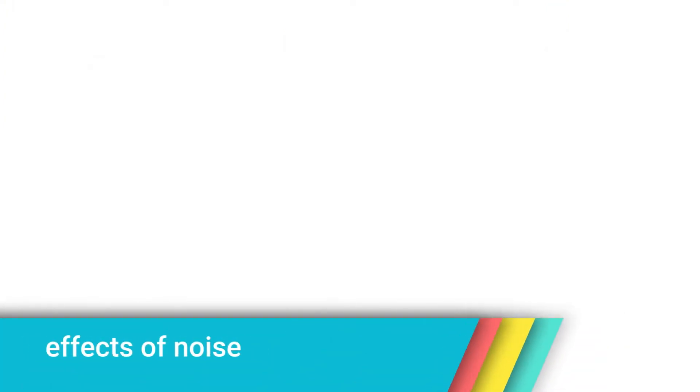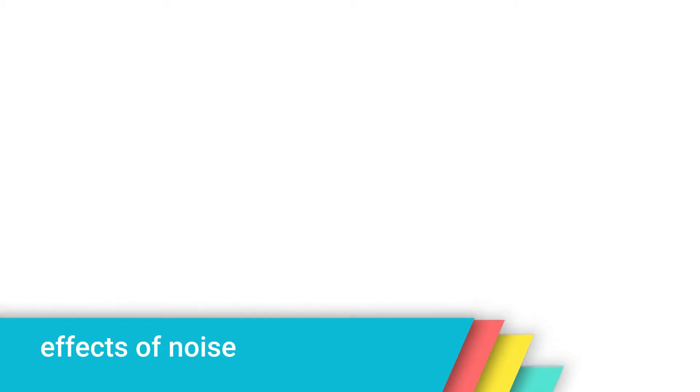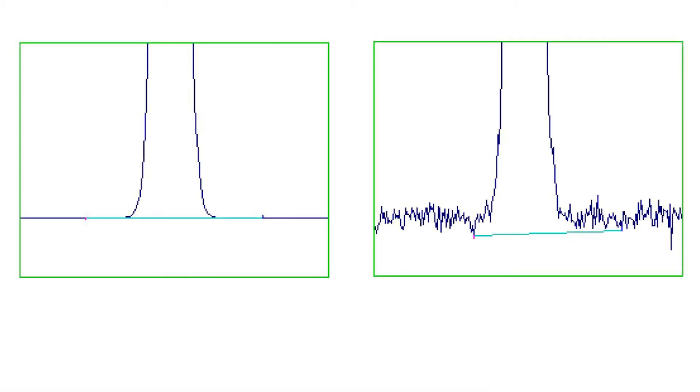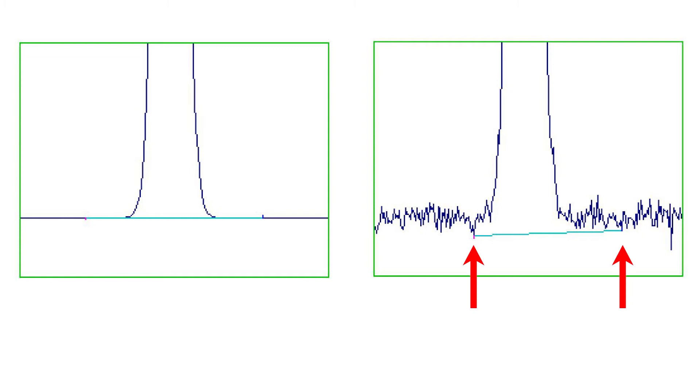Effects of Noise. Noise affects the integration of peaks in several ways. The chromatograms shown on screen show the lower regions of two identical peaks, with and without added noise. Notice that the noise has affected the baseline in two ways. It has altered the starting and ending points of the baseline, and it has lowered the baseline.